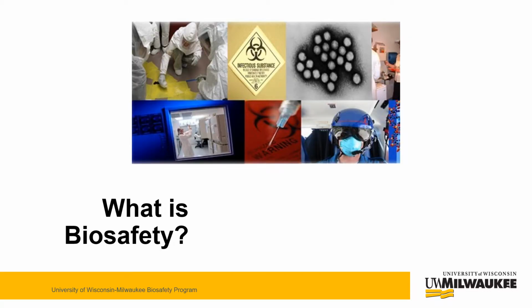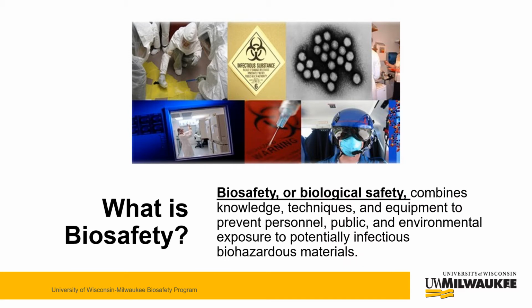What is biosafety? Biosafety combines knowledge, techniques, and equipment to prevent personnel, public, and environmental exposure to potentially infectious biohazardous materials.